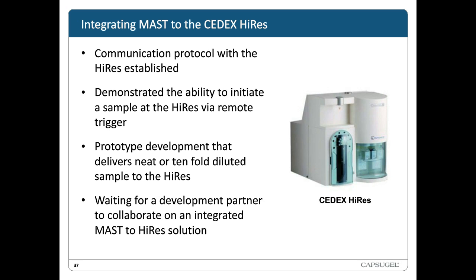Some other things we're working on: we are working with Roche Diagnostics to integrate two devices. One is the CEDEX HiRes. We have a system here in our facility. We have established a communication protocol with the HiRes, and we have demonstrated the ability to initiate a sample at the HiRes via remote triggering. We have a prototype in development that delivers neat or tenfold diluted samples to the HiRes.